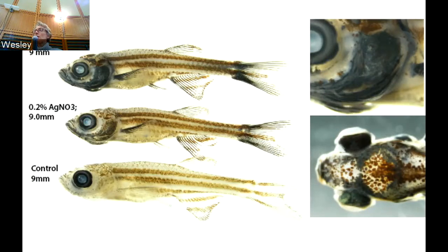But also, because the micro-CTs are based on the mineralization of the bone, it's very difficult to get good data on younger fish. And of course, for the confocal data, the younger fish are precisely what we can get the better data on. So there was a limited period of overlap where we could really acquire data on the same individual.